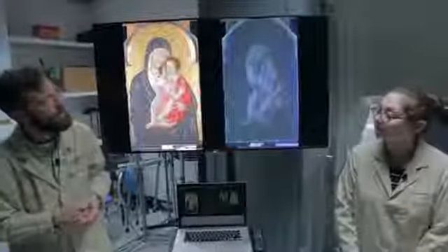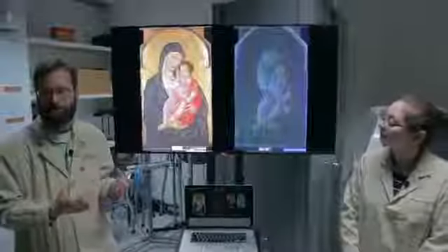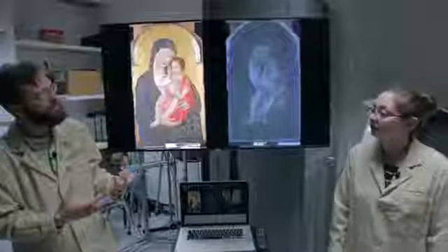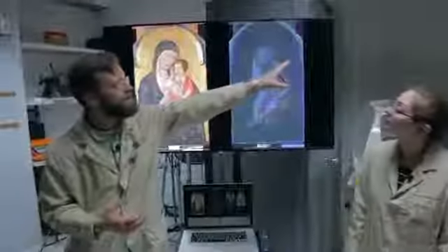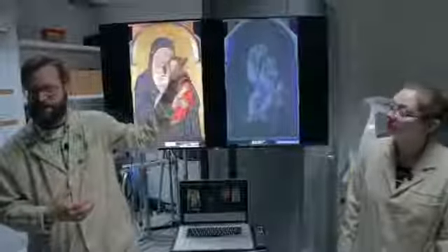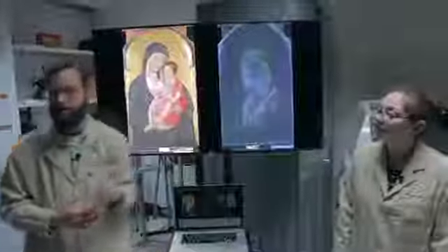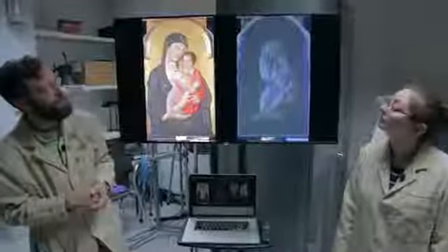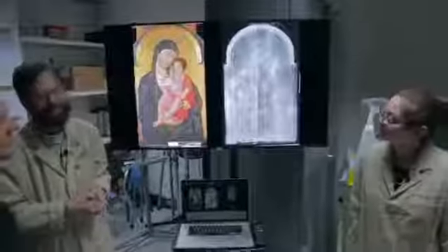Now what you're looking at is a fluorescence image. We've shined a black light onto the surface, and that ultraviolet radiation is going to be absorbed by the varnish and the paint materials, and then re-emitted in the visible, and that's what we're looking at here. It really helps us pick out some things about the condition of the piece. For instance, you can note certain areas that show up different, where under visible light they look the same. This tells us this is a modern intervention where someone has done some retouching, perhaps of a damaged area in that gilding.